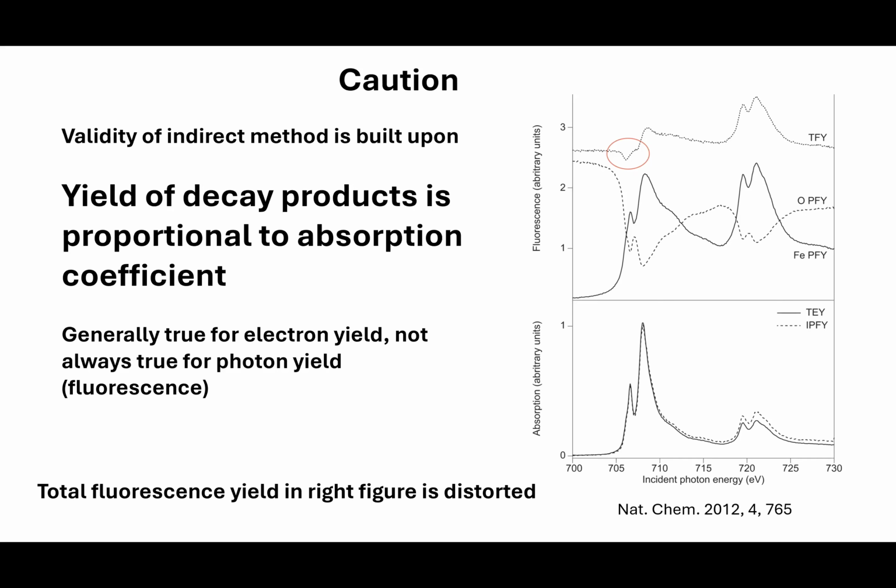And then you probably think, okay, how about we use the ion PFY? So the ion PFY is there, and if we compare the ion PFY with the TEY, which is in the bottom figure, you see they have pretty similar shapes, but something is different. What is different? Actually, not intensity. Peak ratio. Well, yeah, peak ratio is one thing. How about the peak width?